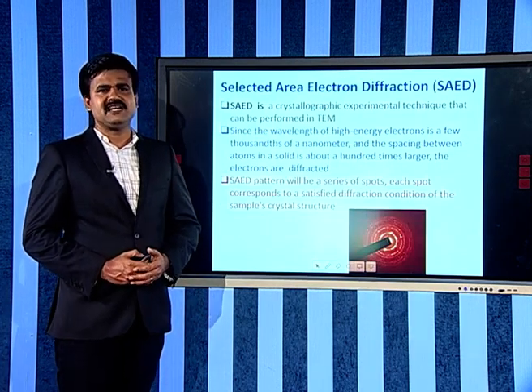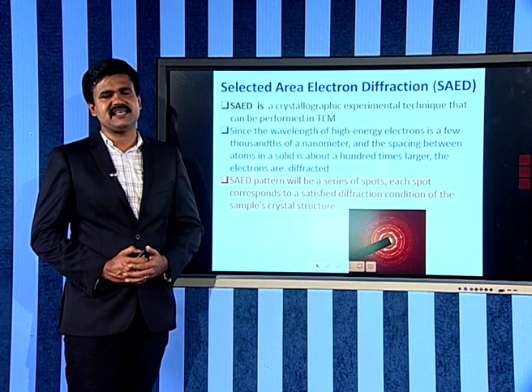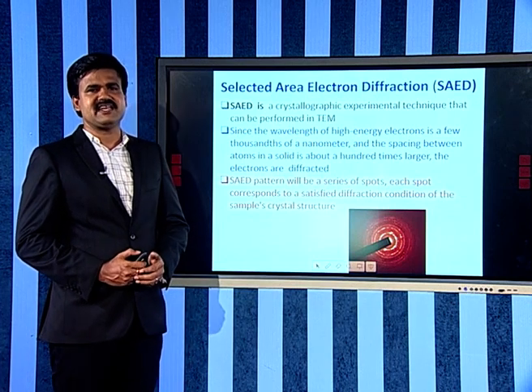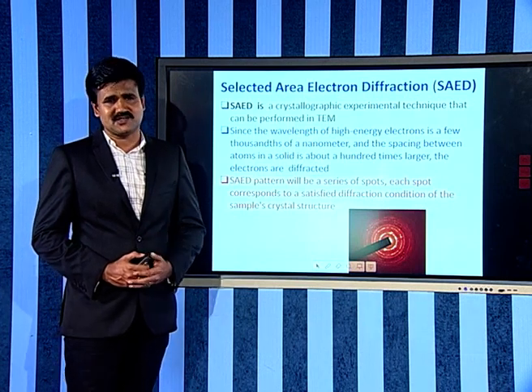Selected area electron diffraction, SAED or SAED pattern, is another application of transmission electron microscopy. SAED is a crystallographic experimental technique that can be performed in the very same transmission electron microscope.